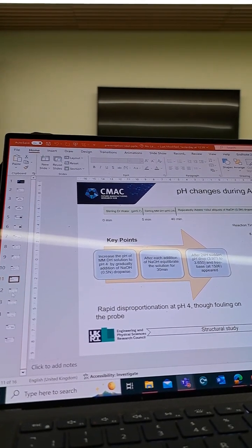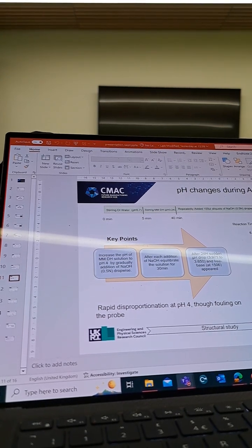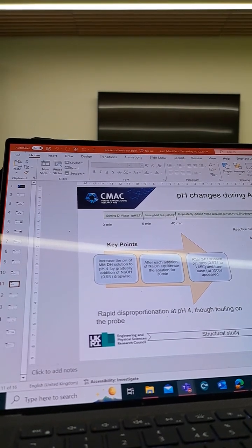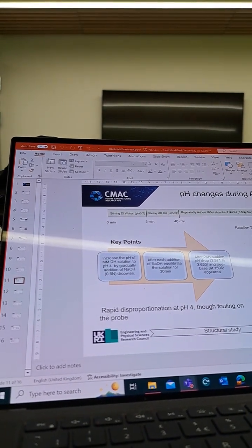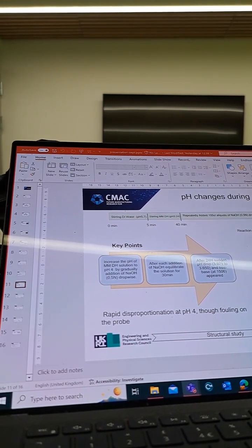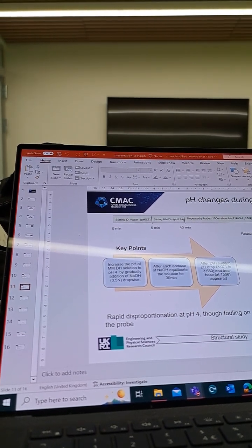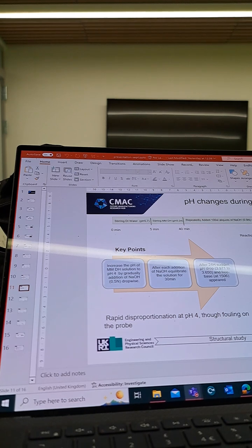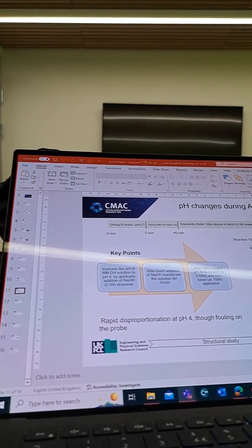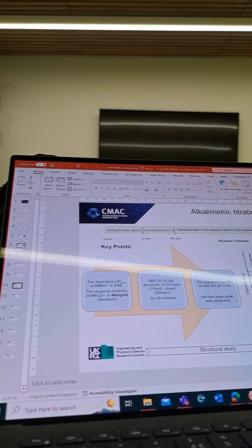He said this doesn't make sense and might confuse industry people, so to make the slides more meaningful, record the change as a function of pH rather than time. Ian said to find the peak area. The second thing he said was to stack the spectra. For example, for miconazole free base we can see the change at the 1506 peak.